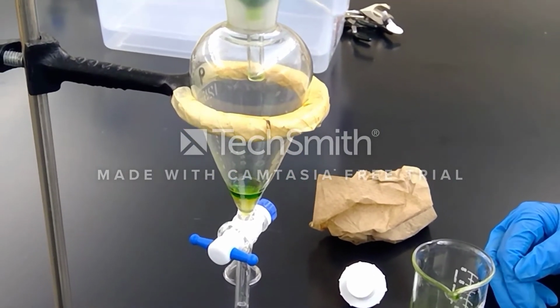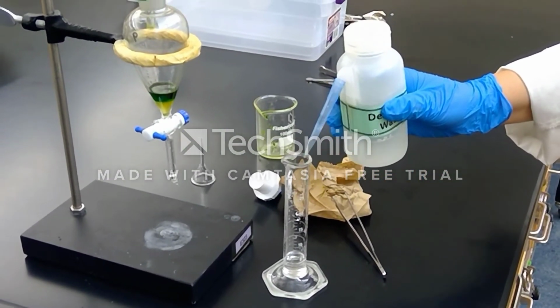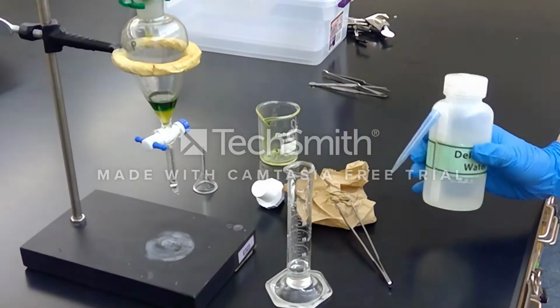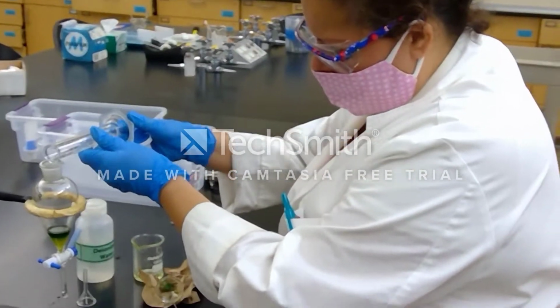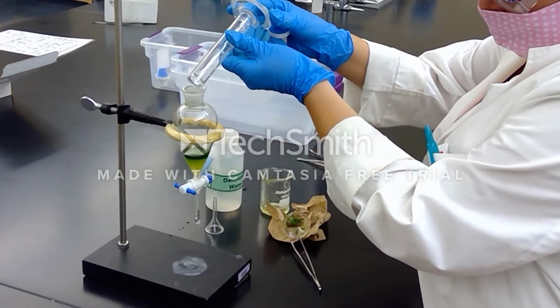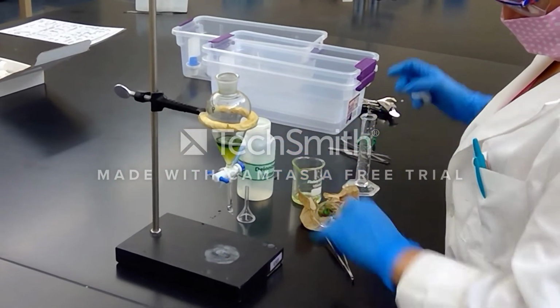in our concoction here. So we need 5 milliliters of deionized water here. I'm just checking my milliliters, just making sure we are at 5 milliliters. So I am now adding 5 milliliters of water to my separatory funnel here. And again, if you notice, the water layer grew, so this bottom layer here grew.